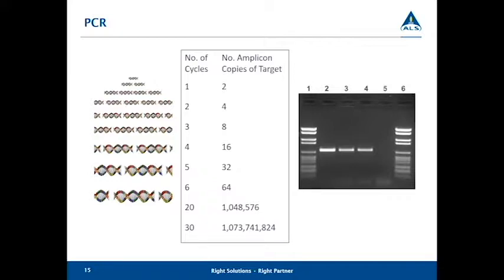We're still dealing with microscopic endpoints. So in order to be able to detect it, we have to replicate that sequence so we can visualize it with our naked eye. The sequence or amplicon is then copied over and over again using an enzyme called Taq polymerase. By heating and cooling the reaction tube over and over again, the Taq polymerase attaches to and copies the target sequence. So in theory, if a reaction is 100% efficient, each heating and cooling cycle would double the amount of the target sequence that we're after.